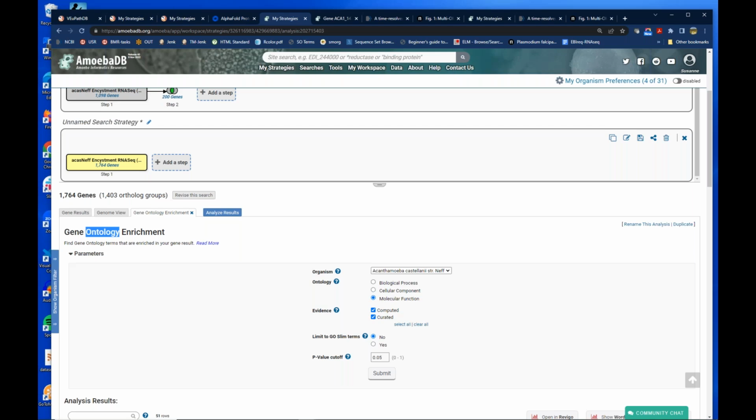Right, thank you. And I guess there's also one caveat with this type of analysis. Obviously, any hypothetical or poorly studied genes may not have any GO term annotations. And as such, when you run enrichment, let's say on the 1764 genes, you also need to be aware of how many of those genes are actually hypothetical and subtract them from the GO enrichment ontology terms that you'll return, assuming that they're not present simply in that group.